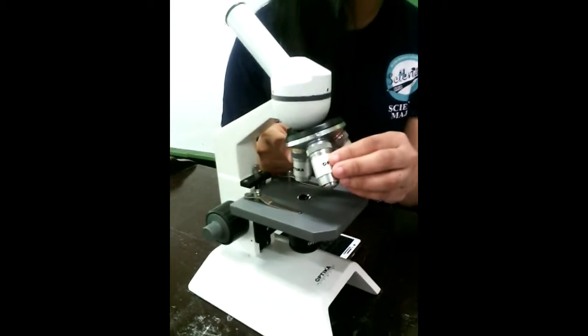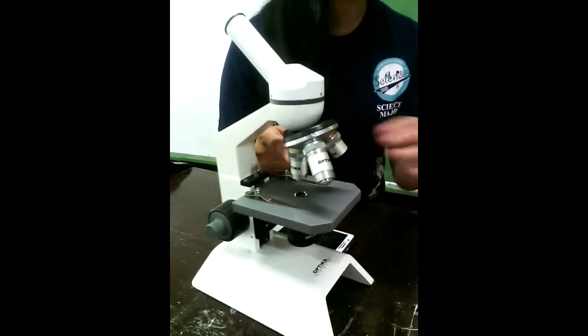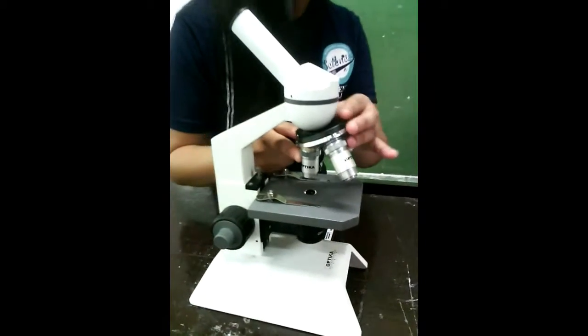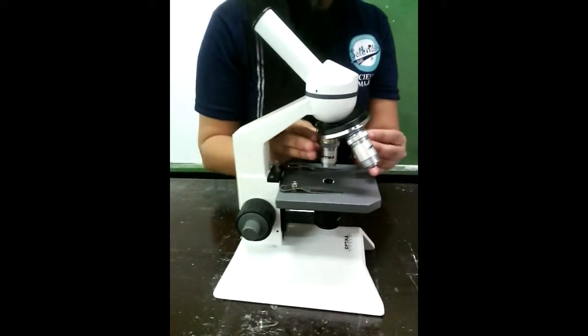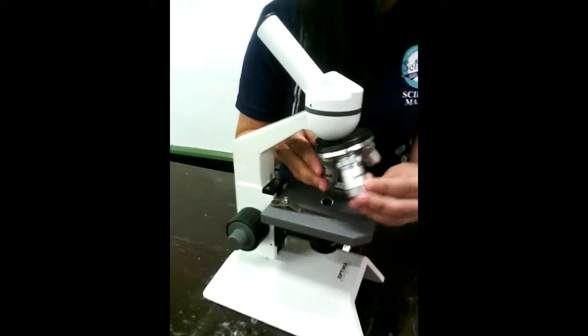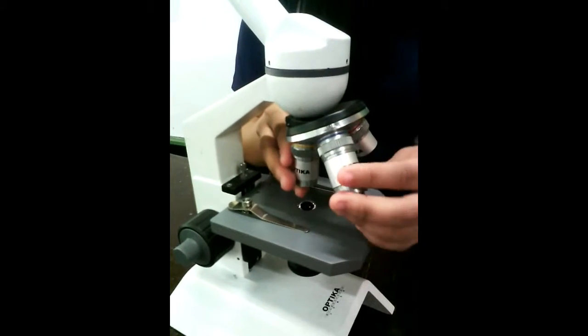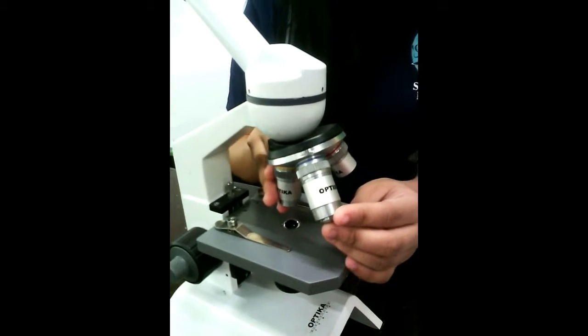The magnification achieved by each objective lens is indicated on the side. Common values are 10 times for the low power, 40 times for the high power, and 100 times for the oil-immersion objective.